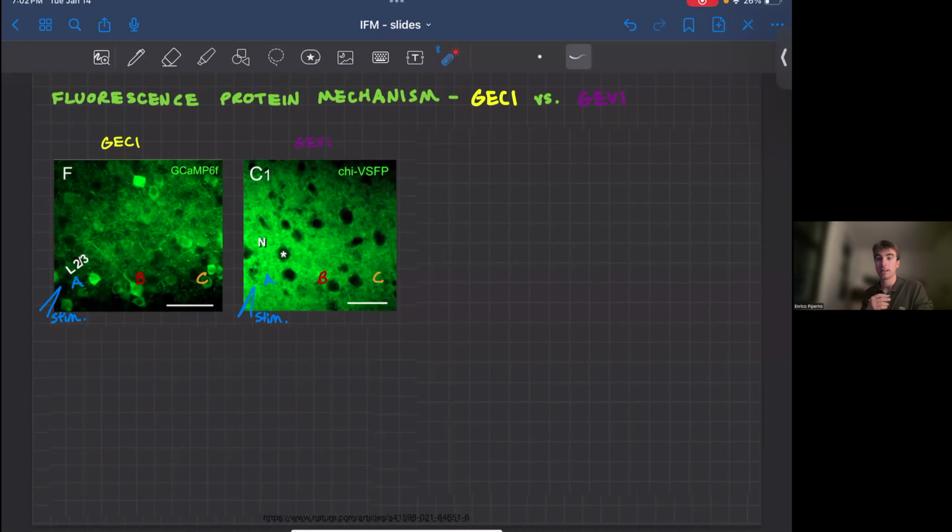To summarize, calcium indicators are a proxy for neural activity and measure only the action potentials within the cell. However, they have the highest SNR and brightness, which allows for a reliable measurement of neural activity, and are the ones most commonly used today. Voltage indicators, on the other hand, measure membrane potential differences and thus can measure subthreshold dynamics. They also have faster kinetics; however, they are not as bright and are noisier.